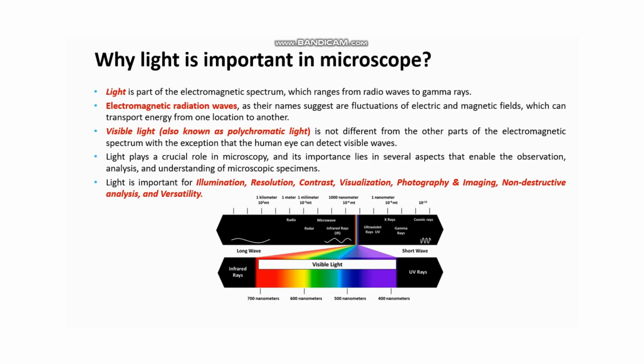We also don't have to forget that light microscopy enables the capture of images and videos of microscopic specimens for documentation, analysis, and also for communication purposes. Digital imaging systems integrated with microscopes allow for the acquisition of high quality images, which can be processed, analyzed, and shared with others.